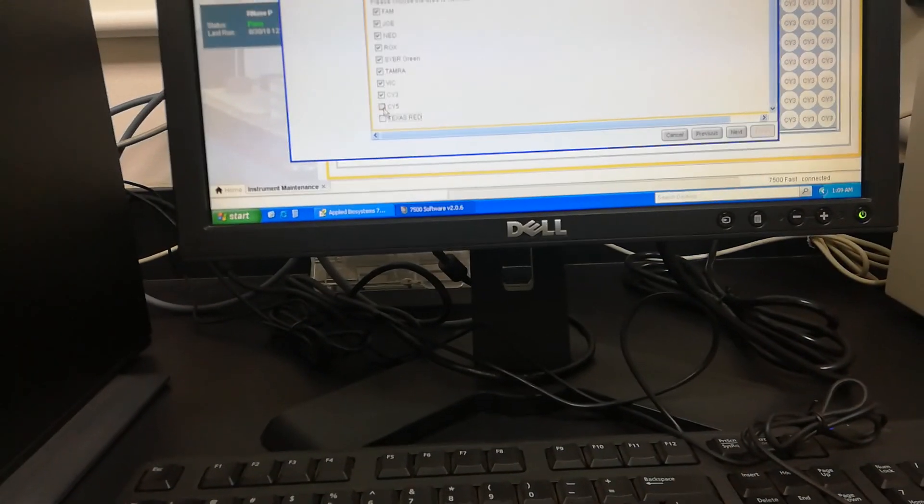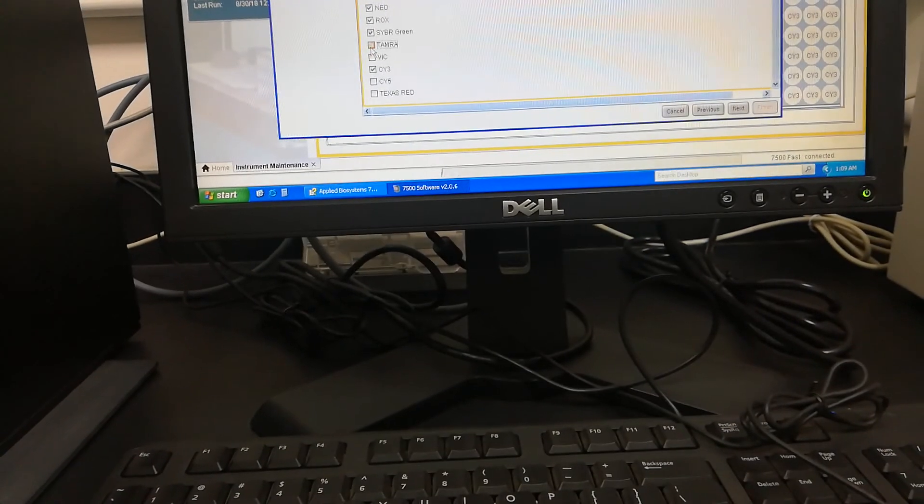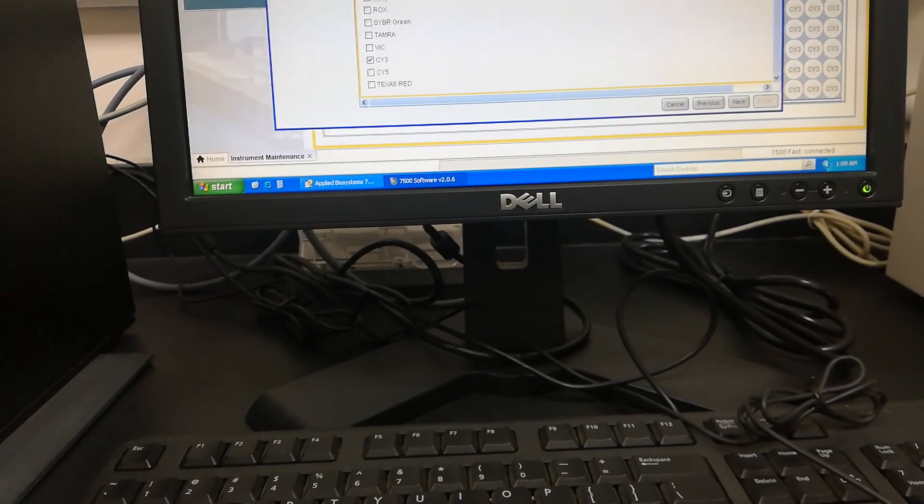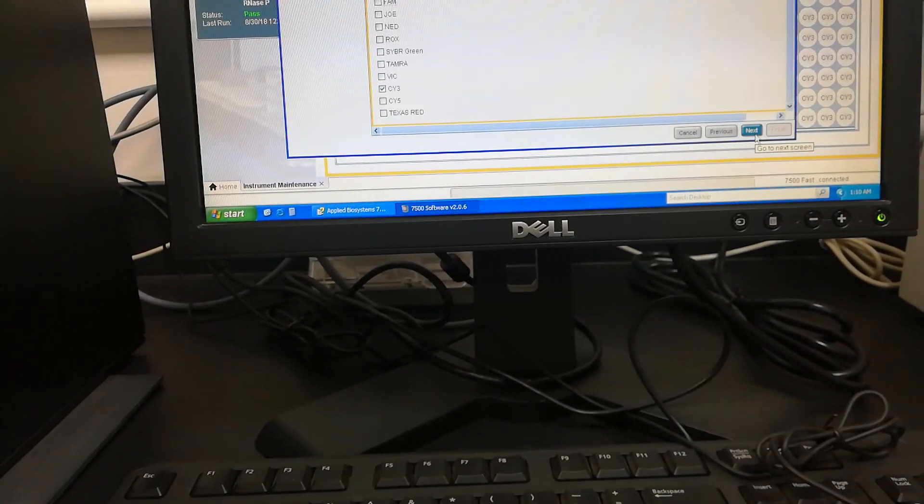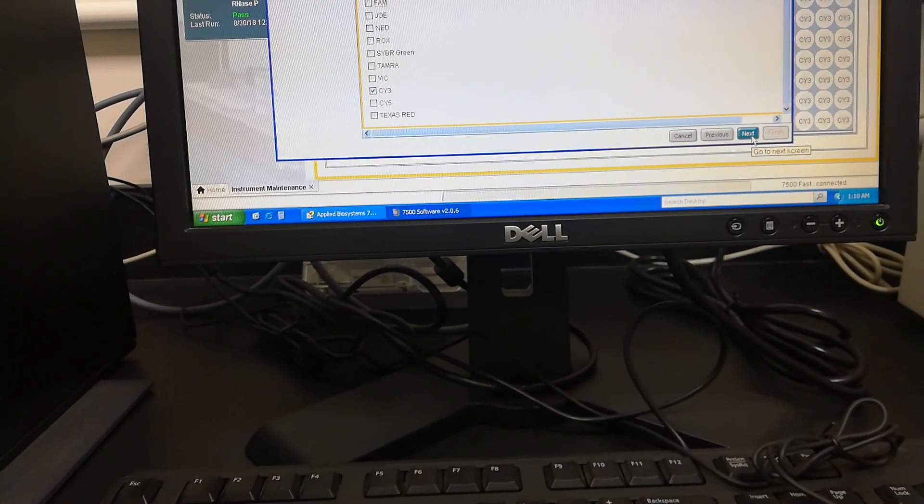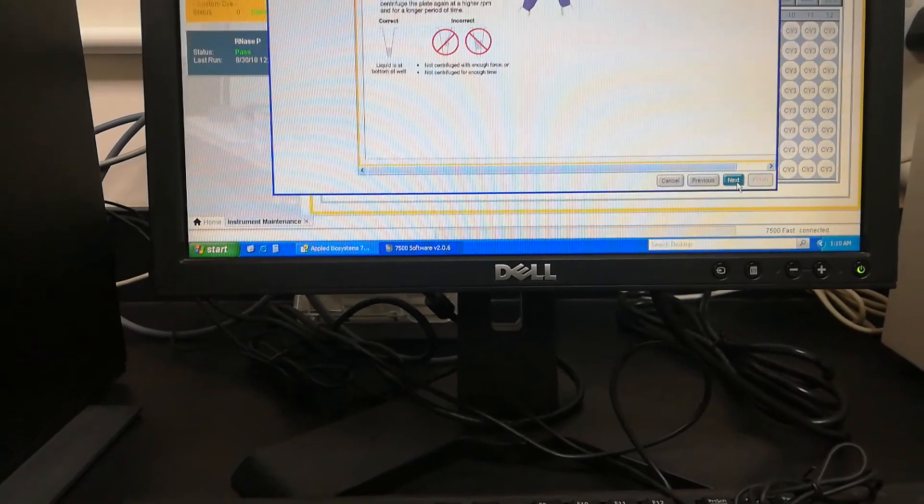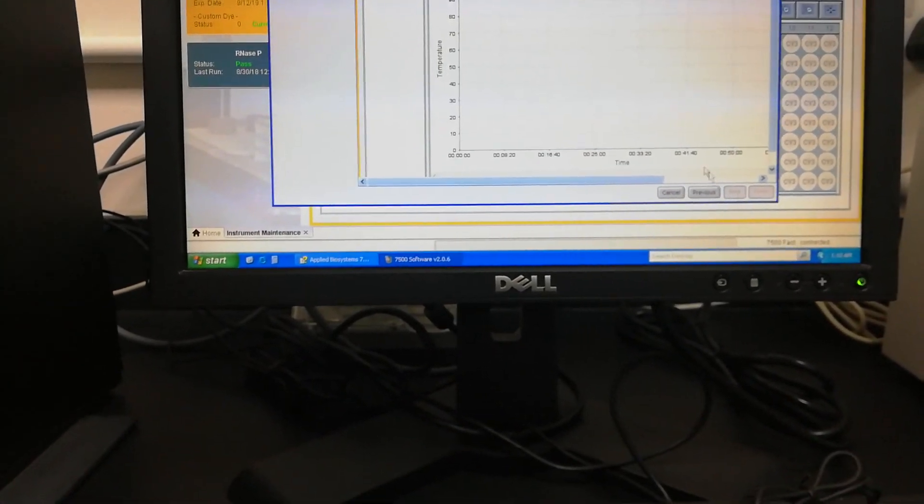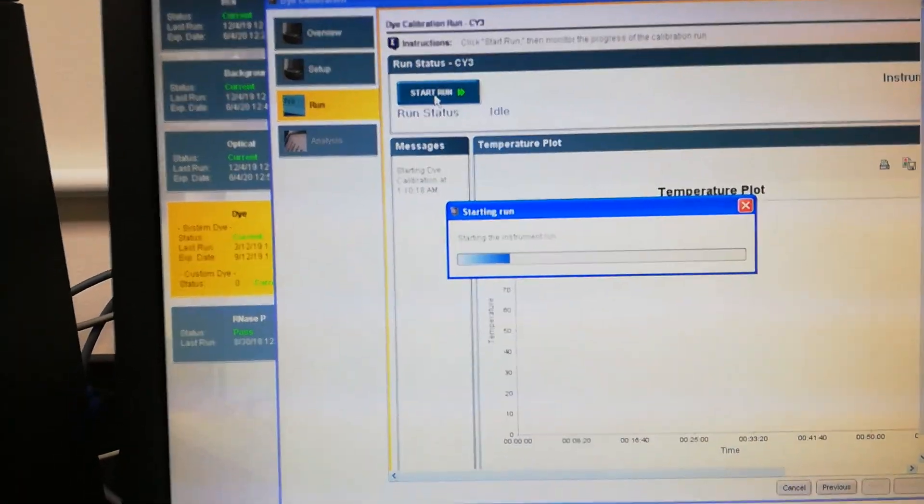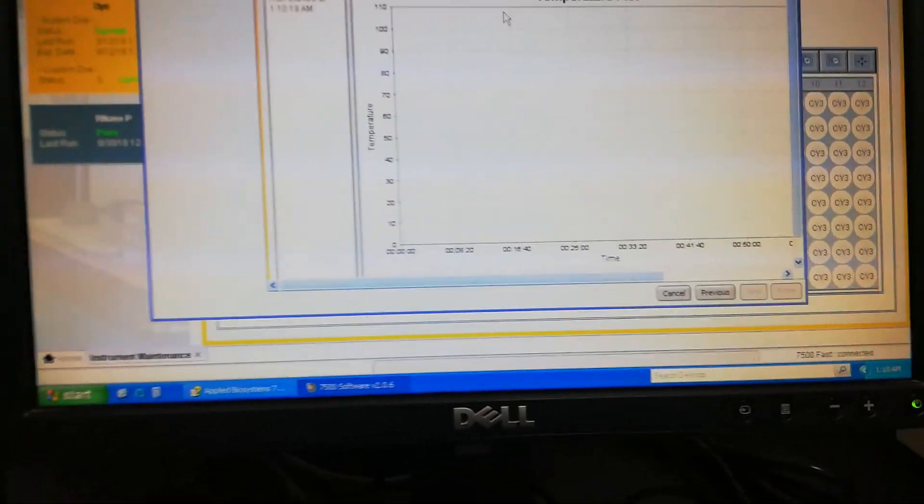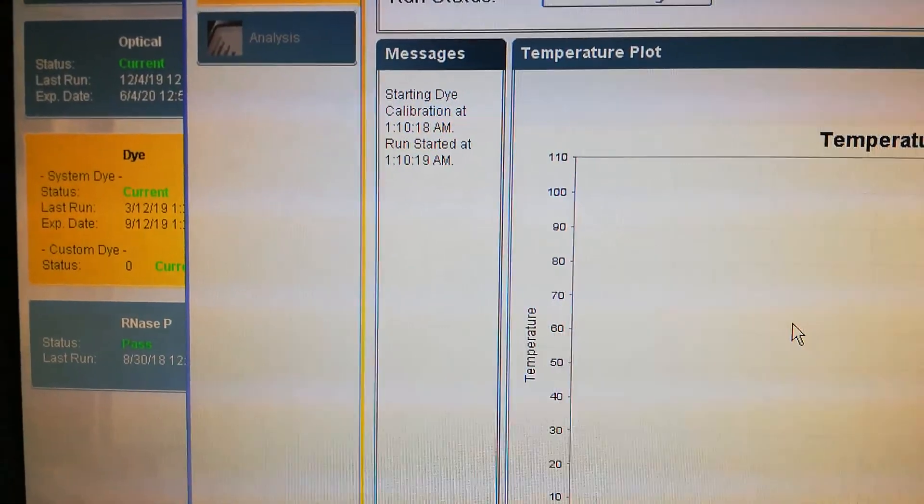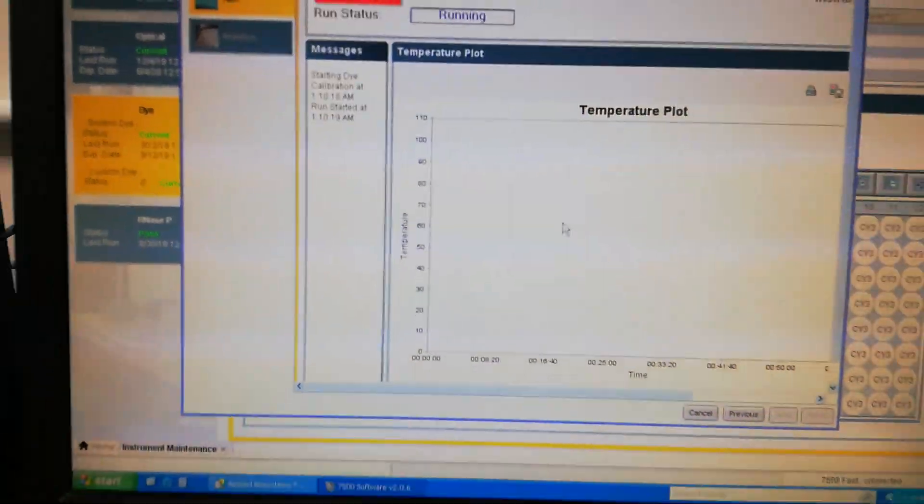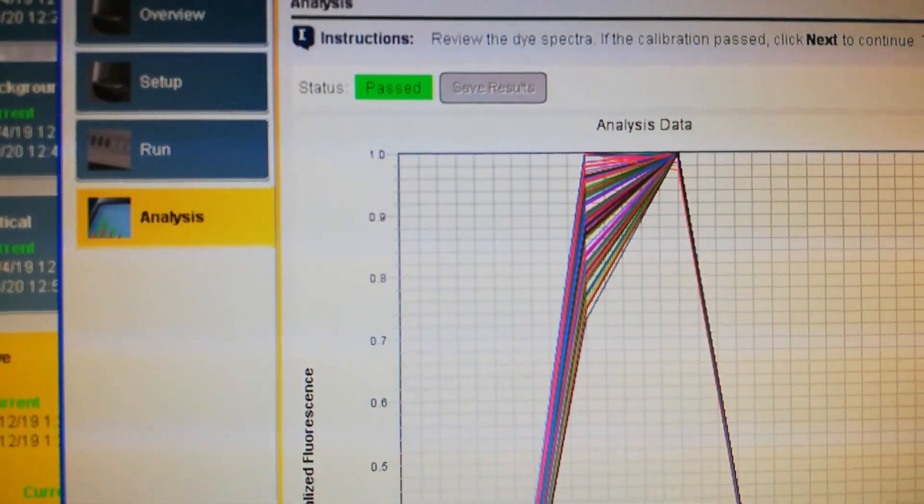This is a dye calibration plate having the CY3 dye solution. I am just keeping this plate here in the block. Close the block. Next, calibrate, here I will show this is CY3. Next, next, next, next, and then start run. The status shows this CY3 is passed.